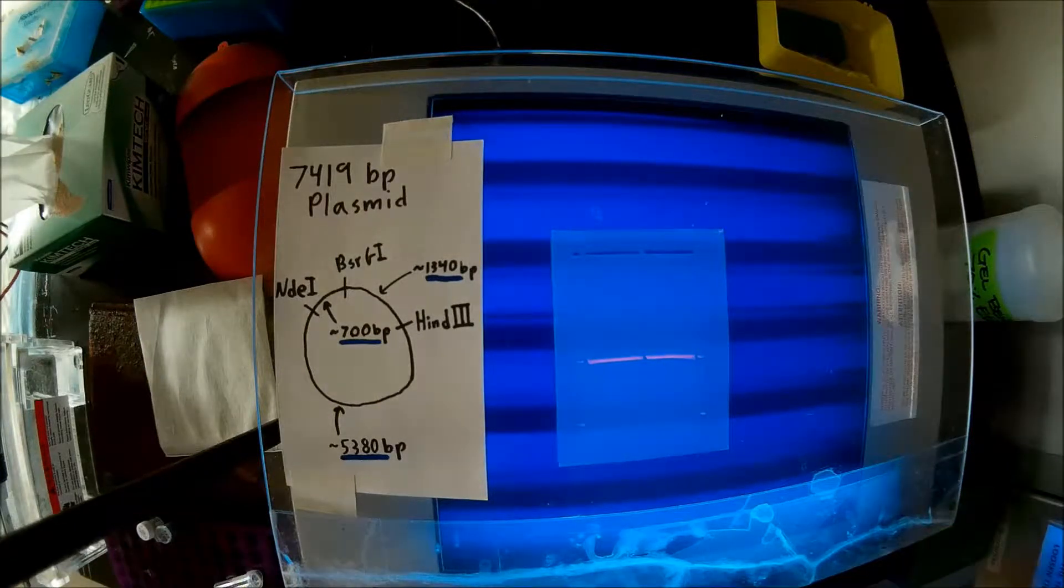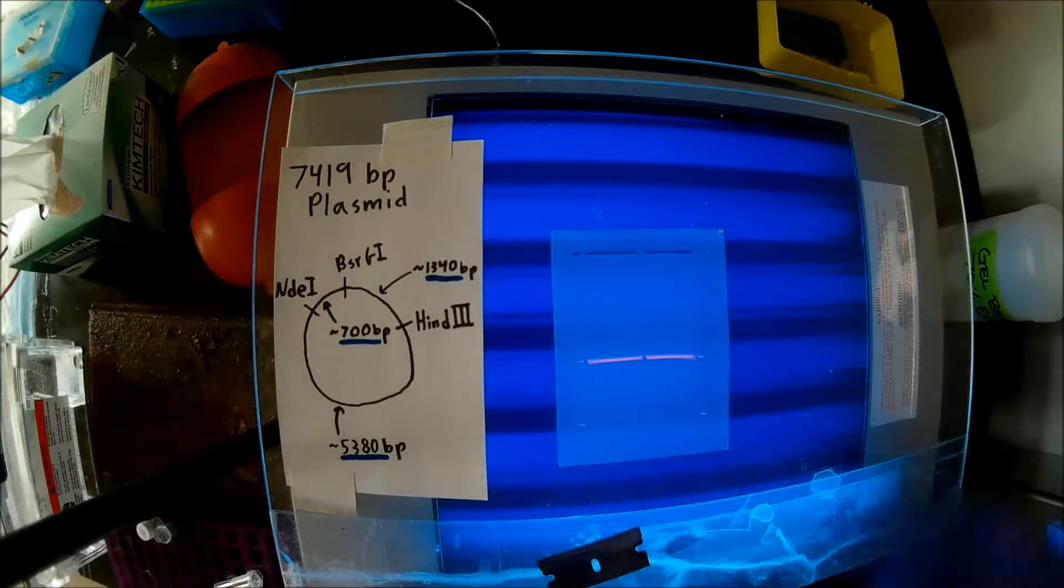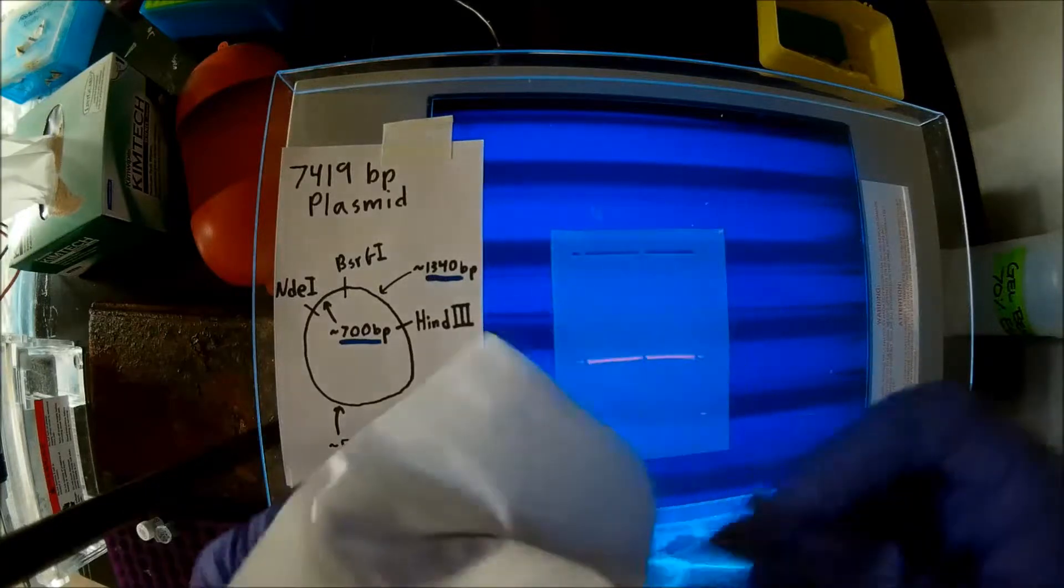So, to cut these out, I'm going to use a razor blade. I'm going to want to make sure that that's nice and clean first. So, I'm going to clean that off with some 70% ethanol and a kim wipe.